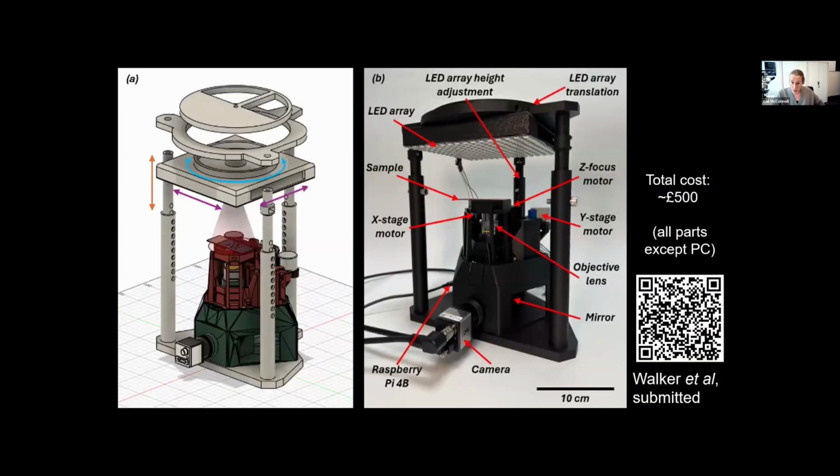We are also printing whole microscopes. So using the OpenFlexure base, we now have a prescription and protocol for printing an open Fourier ptychographic microscope using commercial parts entirely, and 3D printing resins and printers that are widely available. All of the parts and code to run the microscope are freely available. There's a link to the paper here, which is currently in review. So on GitHub, everything is documented, and if anyone wants to try it, that would be great.